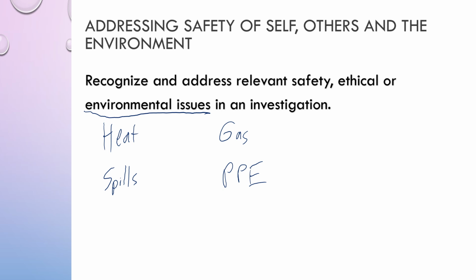At least where I am for most of this, you're going to be referencing the safety data sheets. They used to be called material safety data sheets. But that will have information about safety concerns, exposure concerns, and disposal information typically. So yeah, just make sure that you are aware of this and it needs to be addressed anytime you are beginning a laboratory experiment.